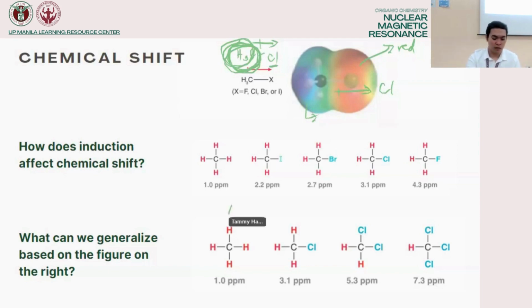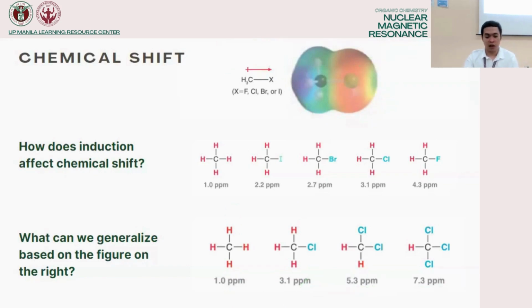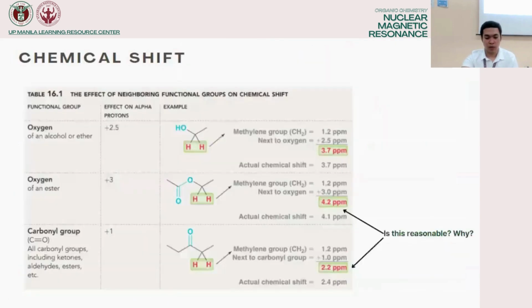Sino ang upfield? A o B? B. O siyempre, downfield ito, mas downfield ito. Ito, upfield na yan. So wag kayong malilito sa ating chemical spectra, sa shift natin, sa spectrum. Okay? Sana hindi tayo nawala? Ayan yung value. So let's go here.